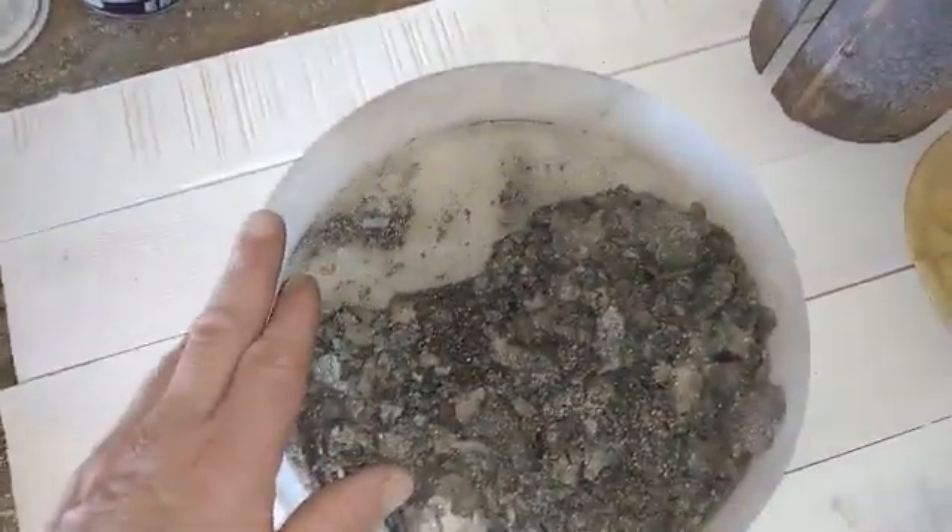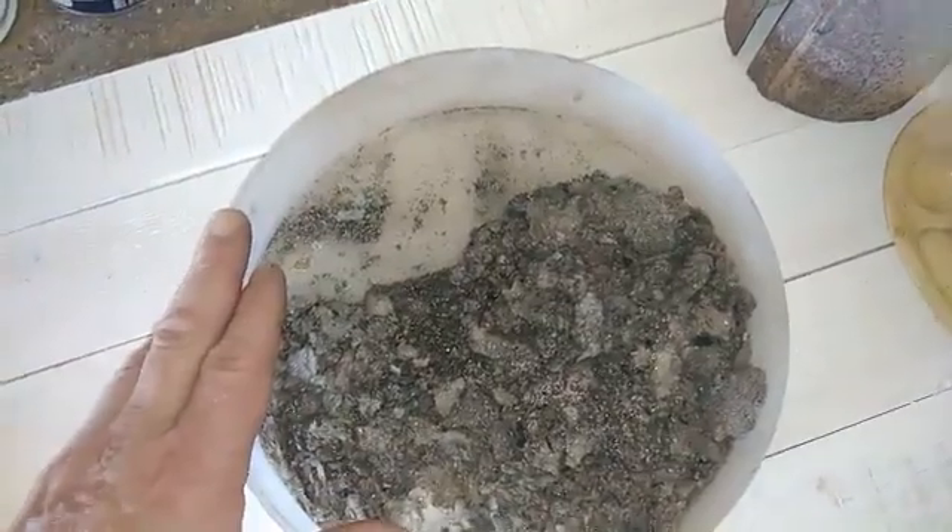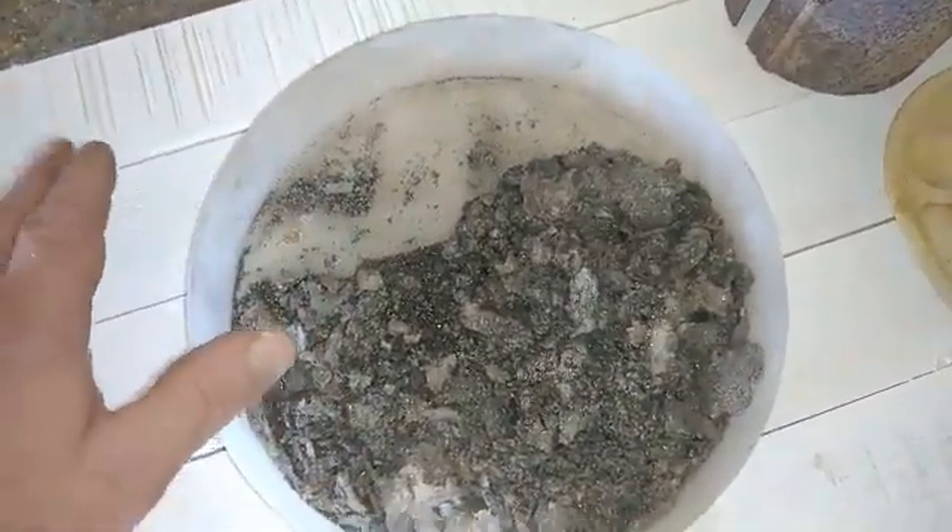My second test was nitric acid. The result is the same — these foils did not react with the nitric acid.